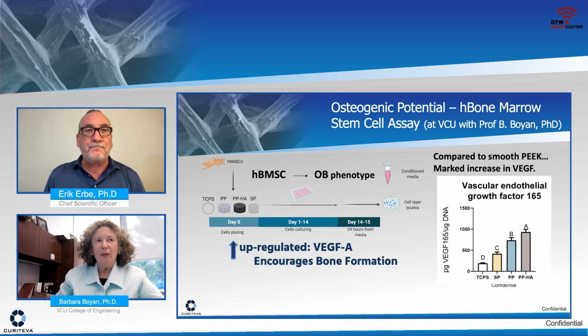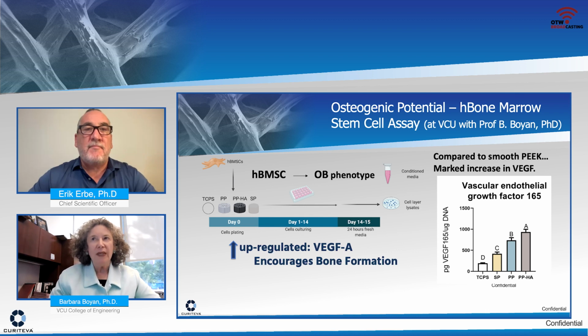Yeah, thanks. The experiment that we set up was similar to experiments that we've done with other materials. We put the cells, in these cases, we use human bone marrow stromal cells. We culture them on the surfaces, and we always have a control, which is tissue culture polystyrene. That's the TCPS there you see on the slide. When we cultured these cells on these surfaces, what we found was something really surprising. On the porous PEEK with the HA coating, there was a marked increase in VEGF. That's the vascular endothelial growth factor.